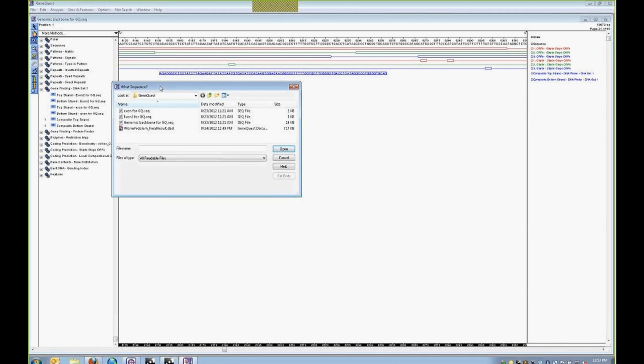The most interesting files that you're going to want to use are going to be larger unknown sequences. With the amount of information available at NCBI, locating novel sequences is becoming easier and easier to do with some of the other tools. So this is really designed if you have a novel strand of DNA and you're not really sure where to begin looking for those particular coding regions.